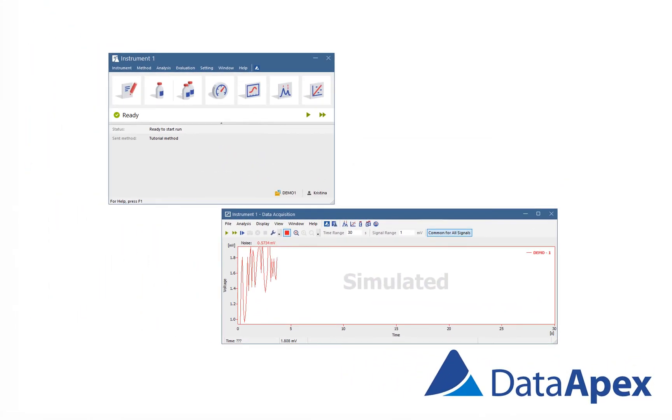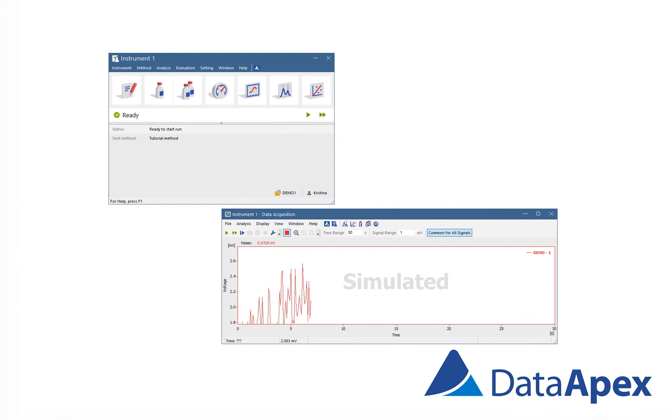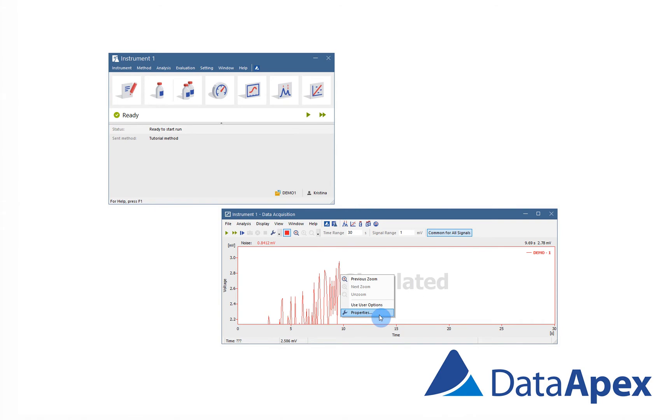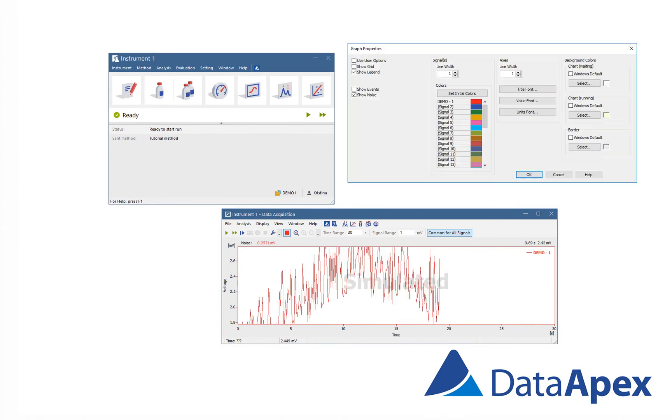Further settings of the data acquisition window is found in the graph properties. Right mouse click in the graph and choose properties.